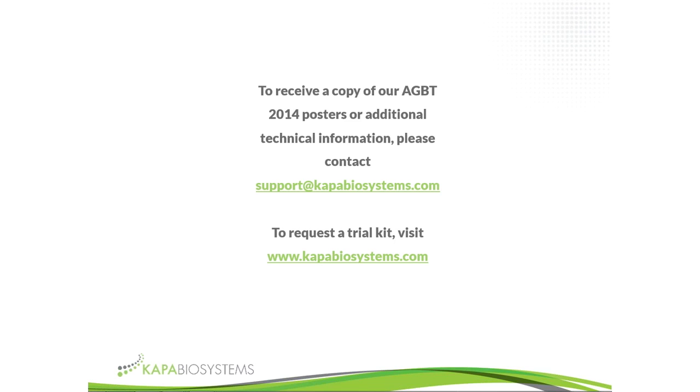Yes, so people use both. We would recommend, and again there are some limitations in terms of throughput and sample handling, using the human genomic quant and QC assay for incoming QC, to get an idea of what the DNA sample looks like when it comes in, and then you can base the input into shearing from that data as well.